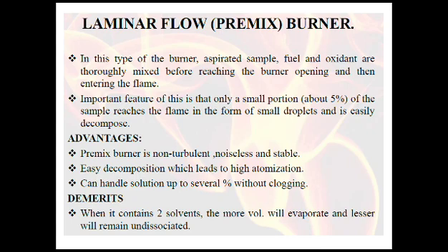An important feature of this is that only a small portion of the sample reaches the flame in the form of small droplets, which easily decompose. Advantages: the premix burner is non-turbulent, noiseless and stable. Easy decomposition leads to high atomization. It can handle solutions of up to several percent without clogging. Demerits: when it contains two solvents, the more volatile will evaporate and the lesser will remain undissociated.